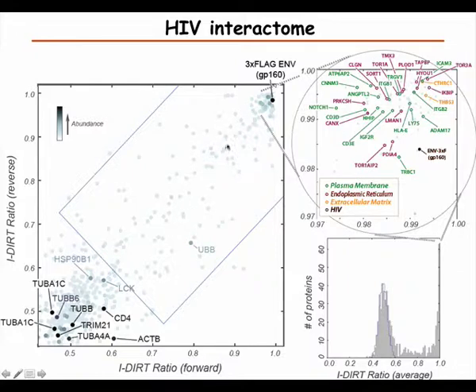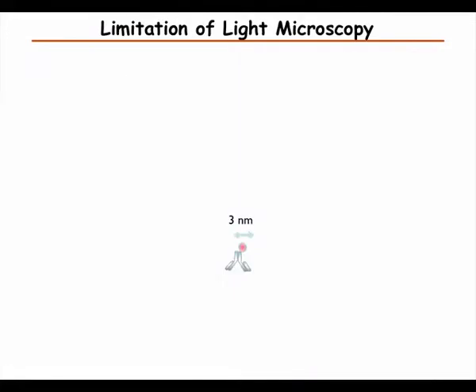You probably can't see that on the screen very well, but there are a whole bunch of dots here, and you can see this background in the middle. So this seems to work really well, and one can find many interactors this way.